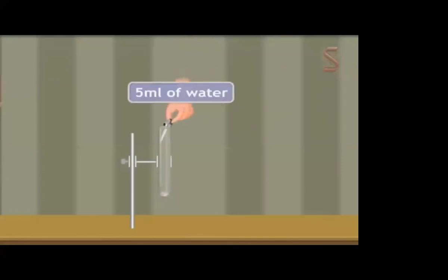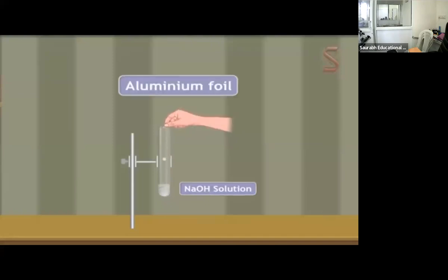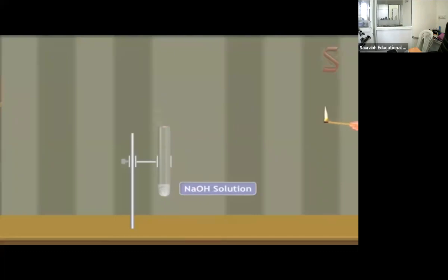Prepare a fresh solution of sodium hydroxide in a test tube by dissolving 3 or 4 pellets of it in 5 milliliters of water. Into this solution, drop a piece of aluminium foil. We now bring a burning splinter near the mouth of the test tube. The splinter is put off with a pop. This shows that hydrogen gas was produced.